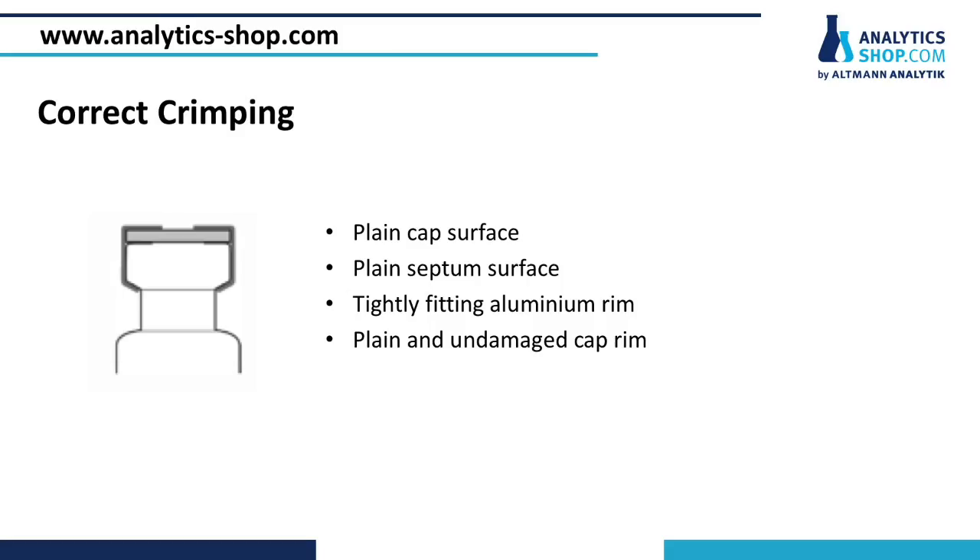A correct and successful crimping result is characterized by a plain surface of the septa and the aluminum cap. Therefore, the optimal pressure has to be applied to the cap. Otherwise, there is a risk of leakage.